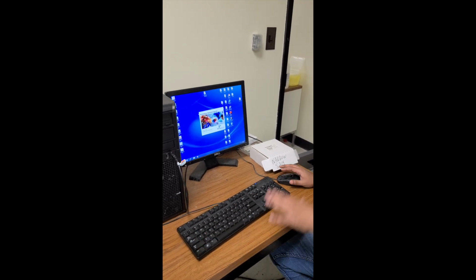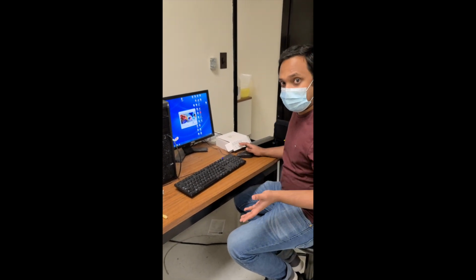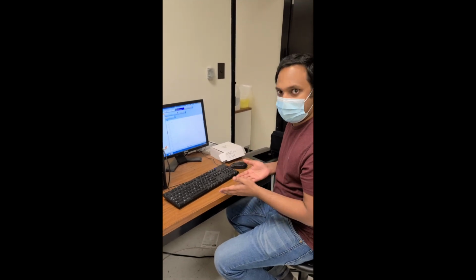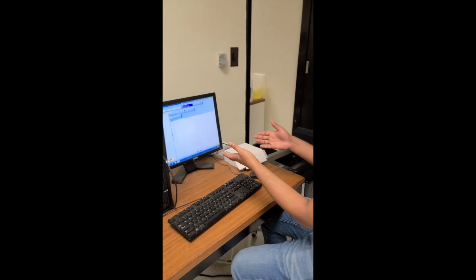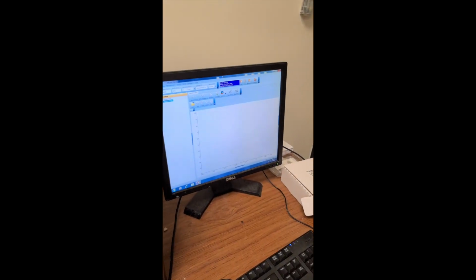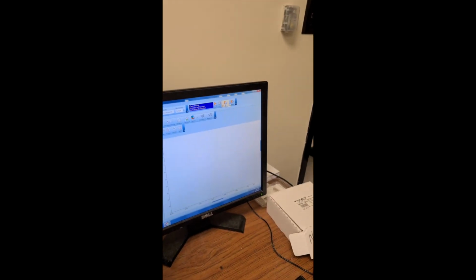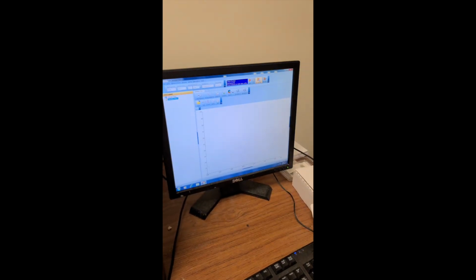and once it is turned on, we are going to run a background spectrum, because for each spectrum that you're running, you need to get a background to make sure that you're eliminating any other background signals. So this is the spectrum that we are going to use. First, what we are going to do is run a background. If you look at the tab above, you will see a tab for background. You just have to click it, and you will see scanning background here.